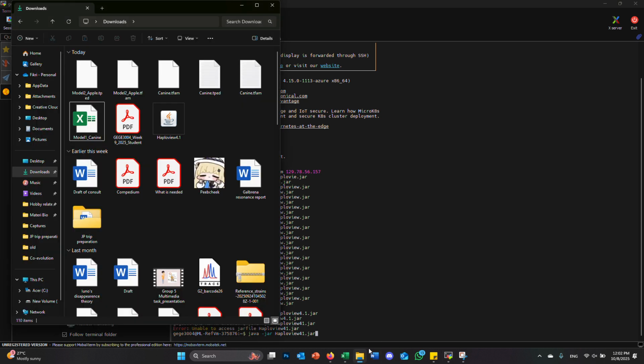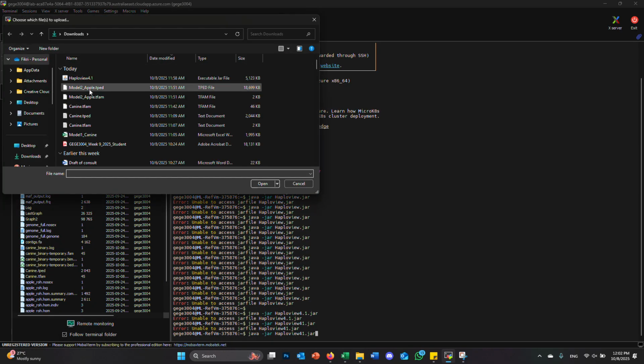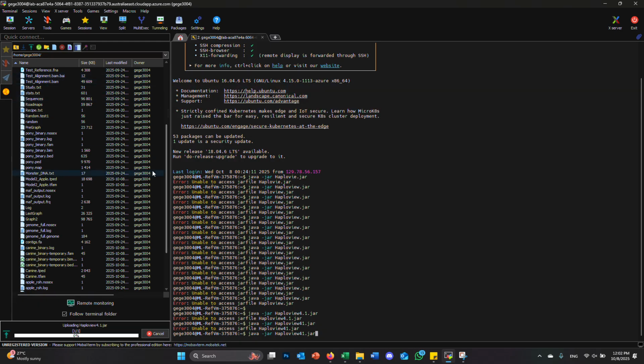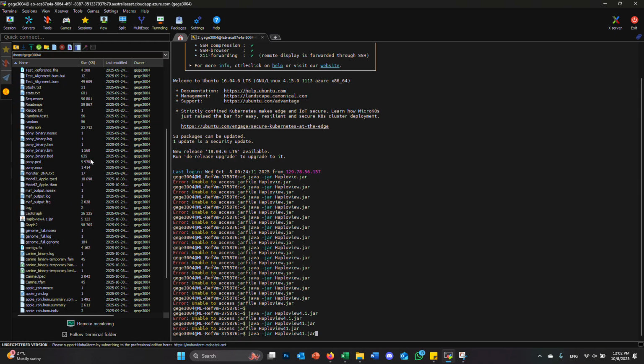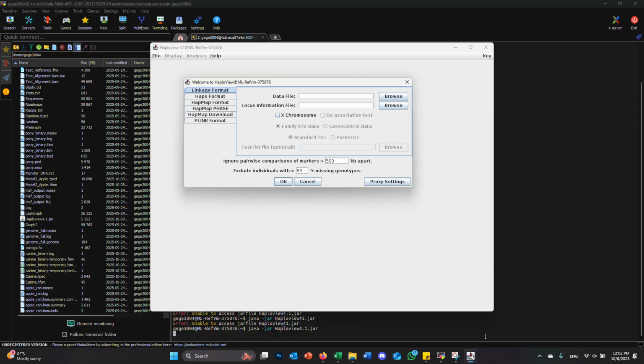For threshold 1, you want to put the number 5. This relates to the indicative significance, so suggested significance. And for threshold 2, you want to put the number 7. This relates to genome-wide significance by Bonferroni correction, which we will get into in deep detail next week. And then for the color key, you want to select chromosome, uncheck the show grid lines box, and then select OK. You should see a Manhattan plot appear on the screen that looks like this.